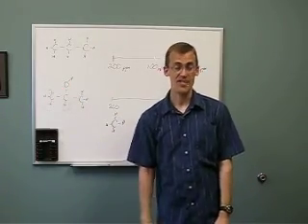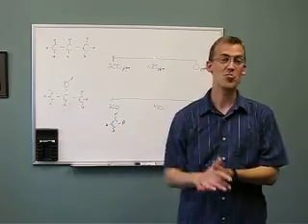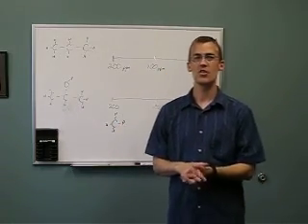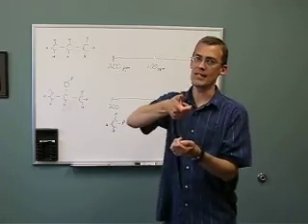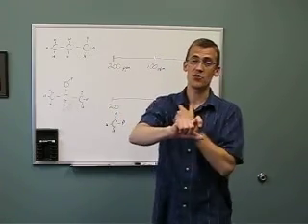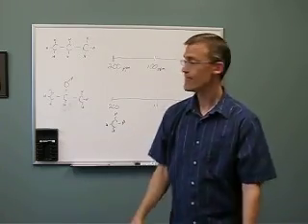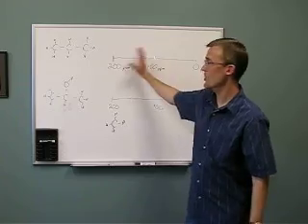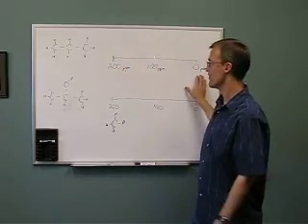Now because of that, its excited state is actually bigger, a little higher in energy. So you can think of it this way: we have to put in more energy to get it to flip against the magnet, and when it flips back, which is what we observe in our experiment, it's going to give off more energy. So this actually turns out to be on the left of the scale. This is higher energy, and this is lower energy.